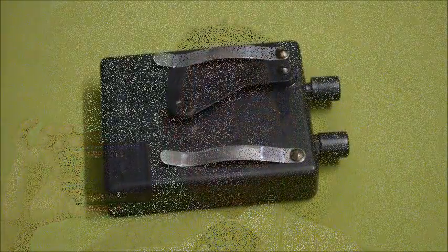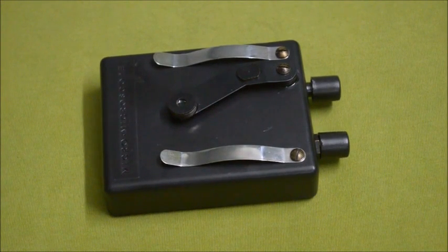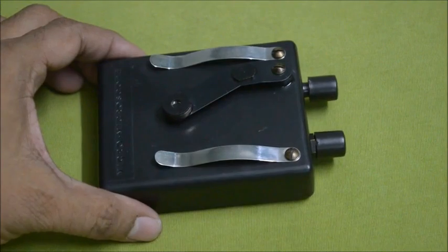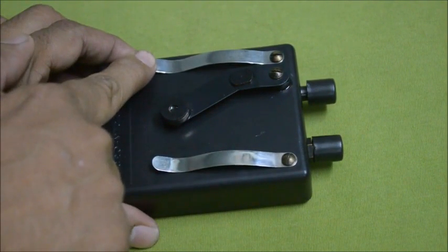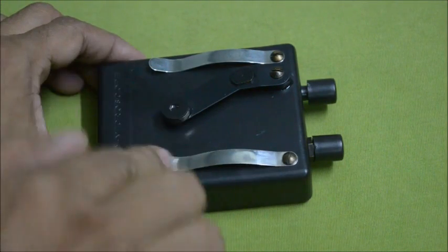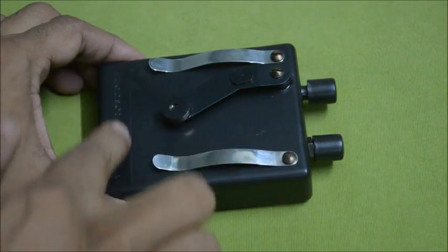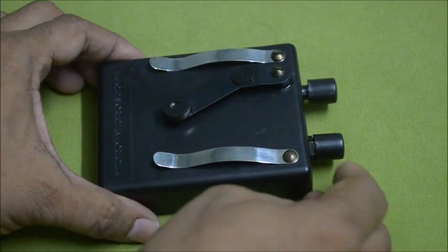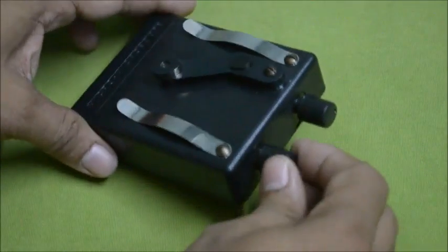Now I will demonstrate the different parts of the micro microscope, model MM-01. These are the slide clips — there are two slide clips, this one and this one. This is the main body, and this is the stage of the micro microscope.